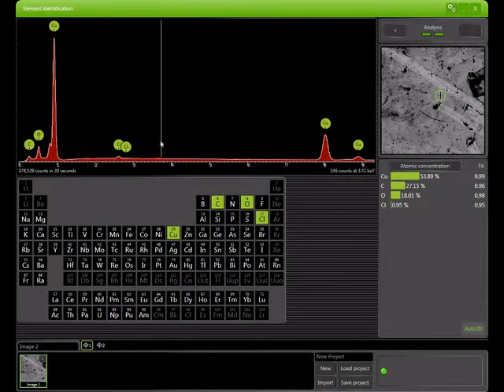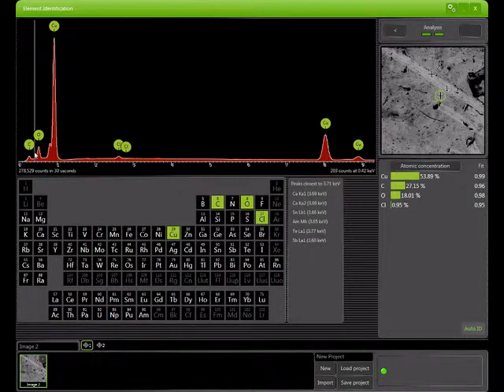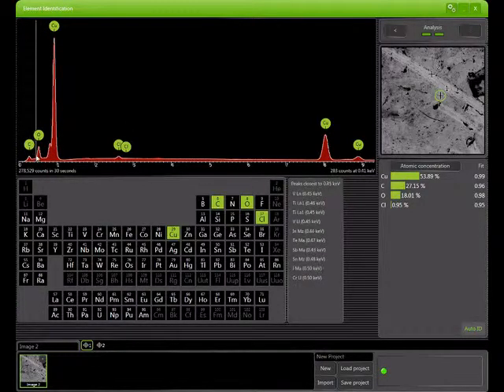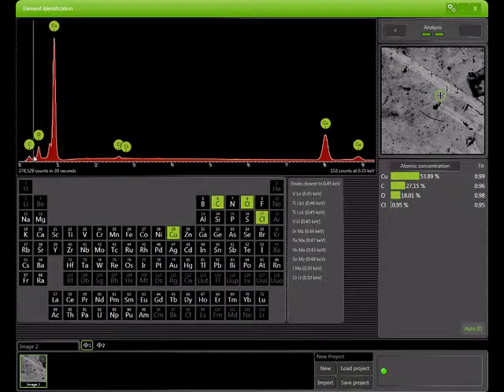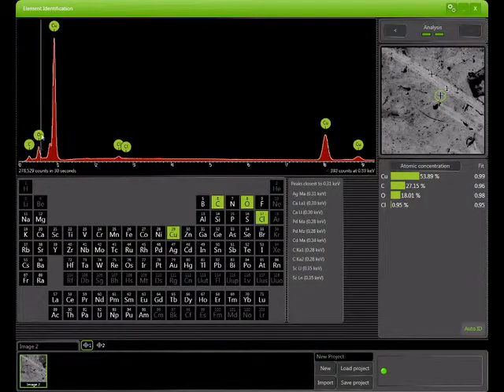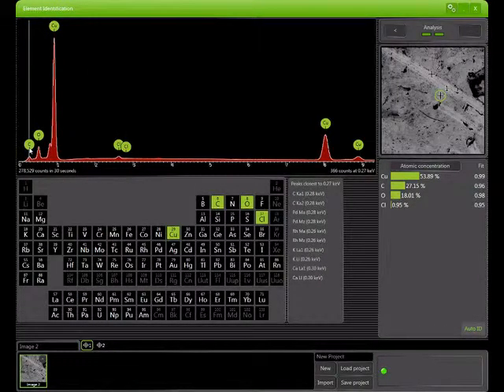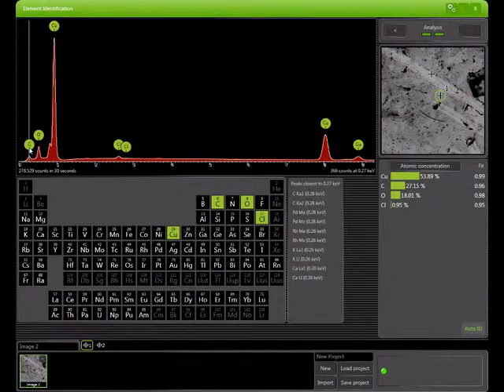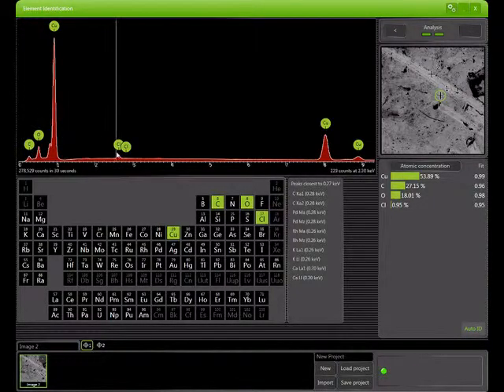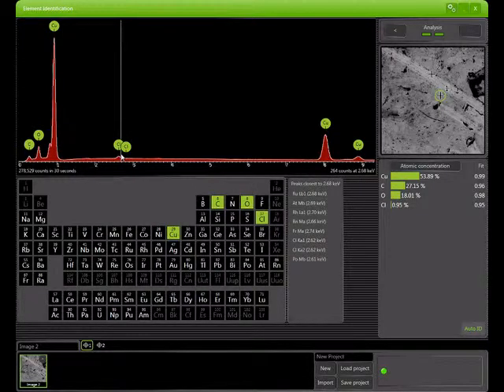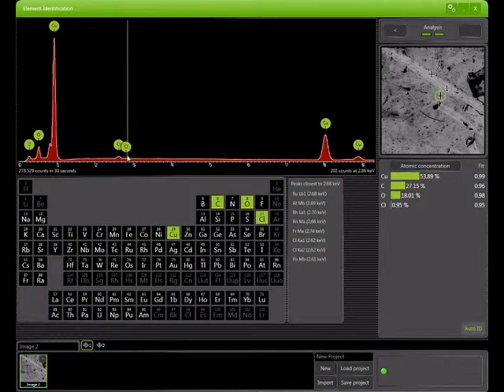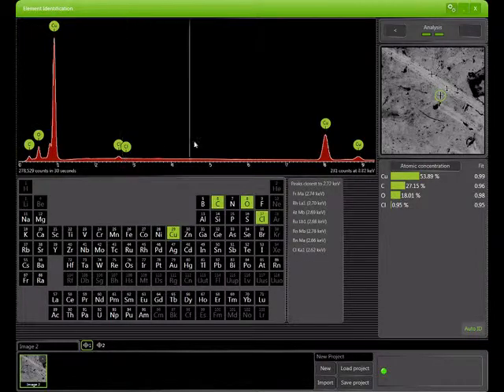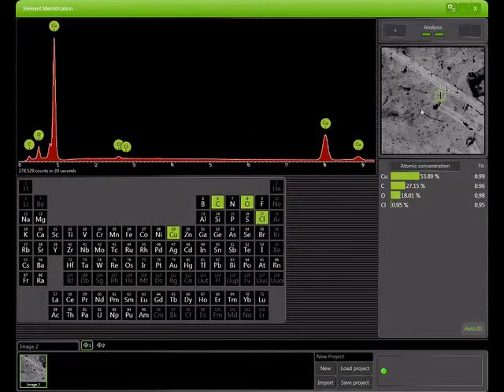This is spot one, which has a little bit of the contamination on it. You can see that there's a decent amount of oxygen, which a pure copper surfaced penny would not have, a fair amount of carbon, and also some chlorine. The oxygen and carbon are basically due to oils which have been converted to a thick dark substance on the surface of the coin, and the chlorine is most likely salt from sweat from people's fingerprints.